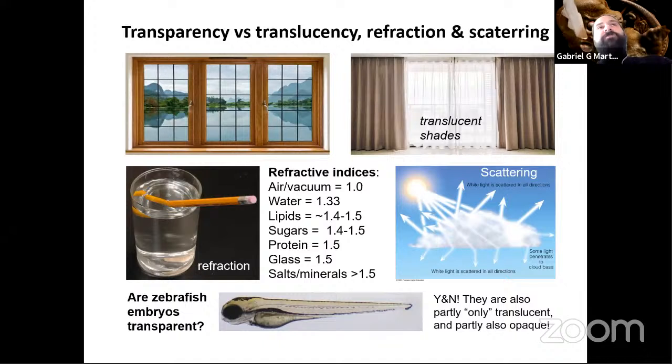Once it goes through the scattering material, in this case the clouds, the light just spreads everywhere. It's quite convenient for us on Earth because we have homogeneous illumination. It allows you to see things very well, but it doesn't work so well in the microscope because it doesn't allow us to distinguish the details on the surface of, in this case, the cloud. But if you want a cell, which is what we're normally talking about on the microscope, what's inside, what's outside, what's on top of other things, it's extremely difficult to get detail out of this. And we'll address this in a little moment again.